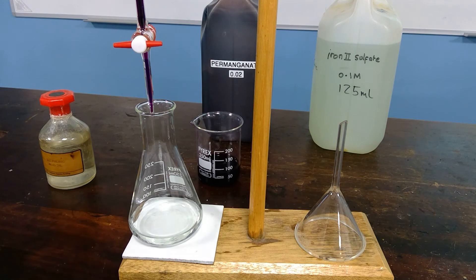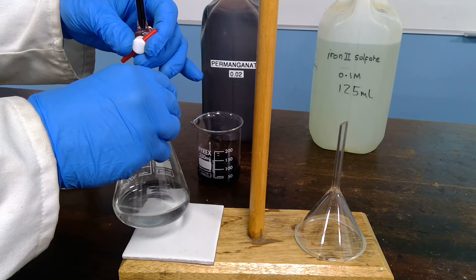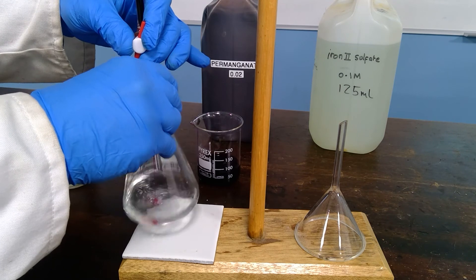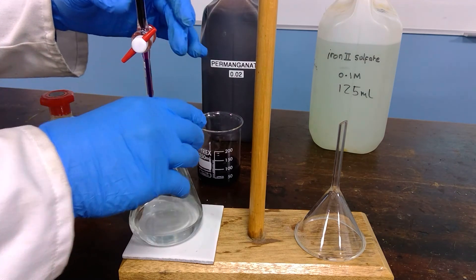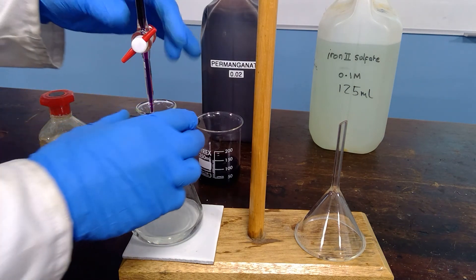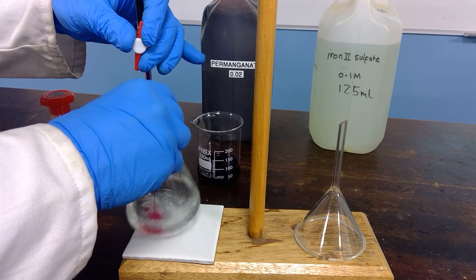As we add the manganate 7, the purple manganate 7 ions will react with the iron(II) ions. The manganate 7 ions become nearly colourless and the iron(II), which is very pale green, is converted into iron(III), which is a very pale yellow colour. As we continue, the purple permanganate will continue to react and disappear.